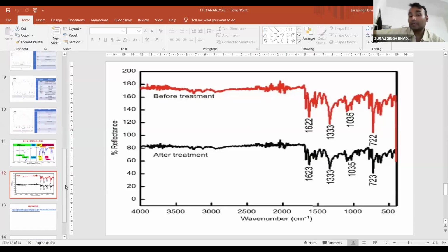Now you can compare it, whether it is going in the right direction or in a wrong direction. So it is the most important part to analyze this type of treatment. Suppose you are prescribing any medicine to any patient for any disease condition at any time interval, at any particular dose, for a long interval, either acute, subacute or chronic diseases. For that condition, you can take the blood sample, the serum sample, and any type of sample from that particular living entity, and you can go for that type of analysis under the FTIR.